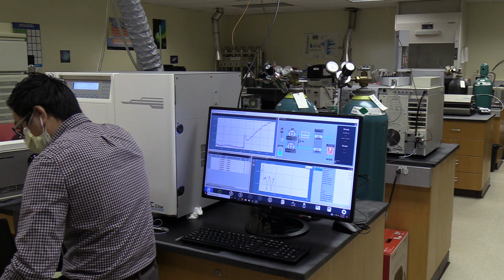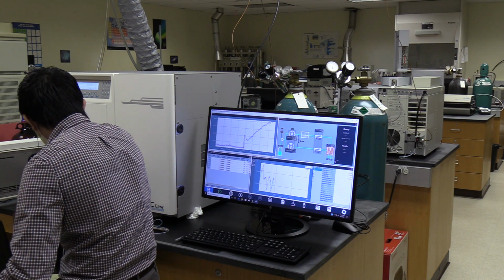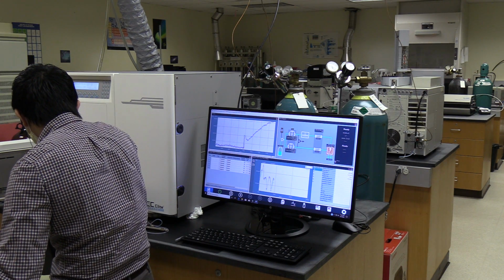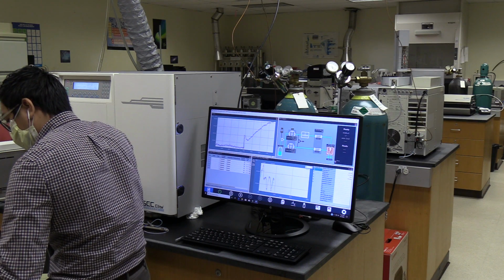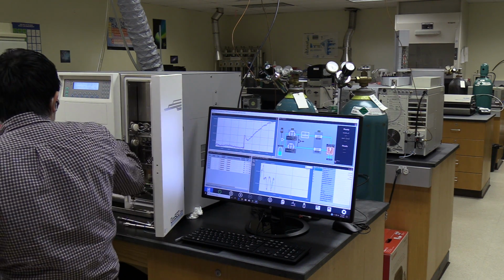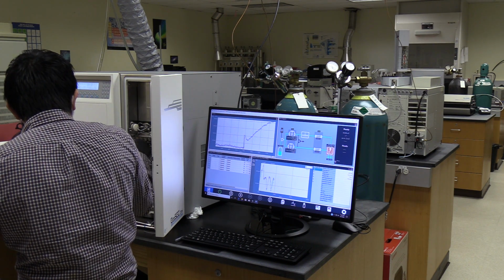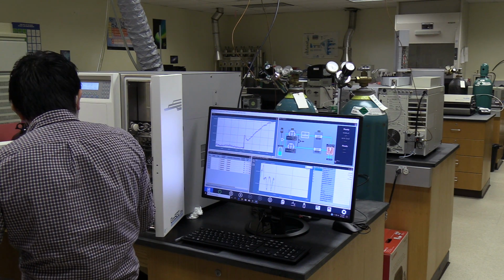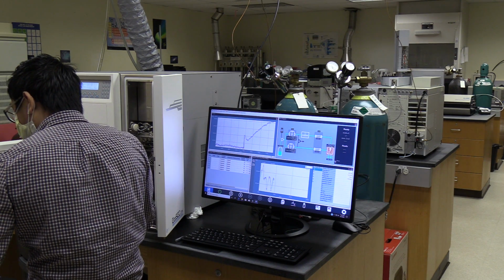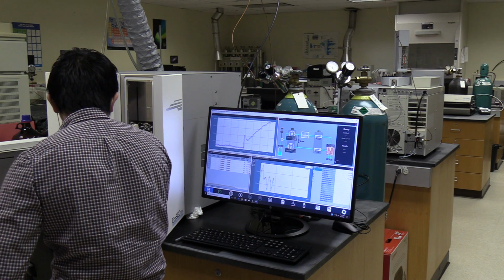After your solvent is pumped from the solvent bottle, it's going to follow this line into a degasser and then go into a T that's going to go into your sample pump and your reference pump. After it goes through your sample pump and your reference pump, you're going to exit the pump oven and then enter into the column oven. This is another temperature controlled column oven. It will also have a vapor sensor, so when you're working with volatile solvent and there's a leak inside the system, it will detect that leak based on that vapor sensor.